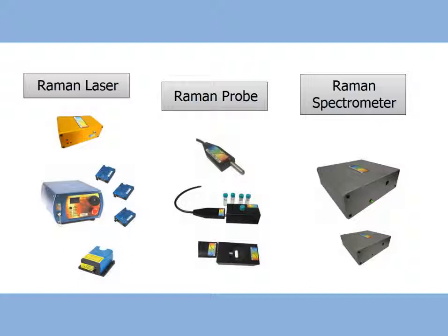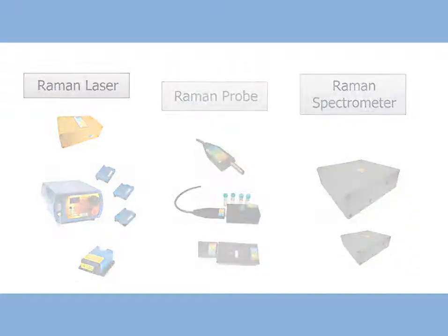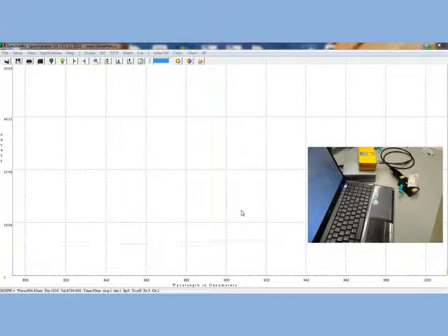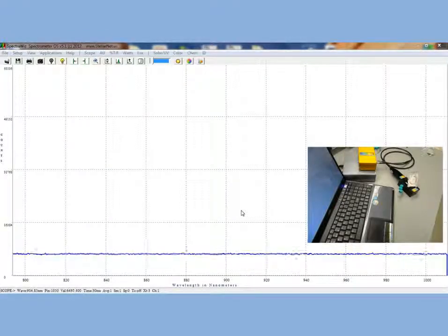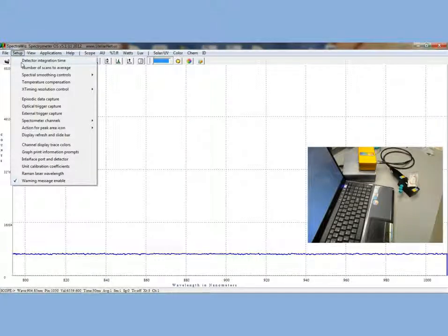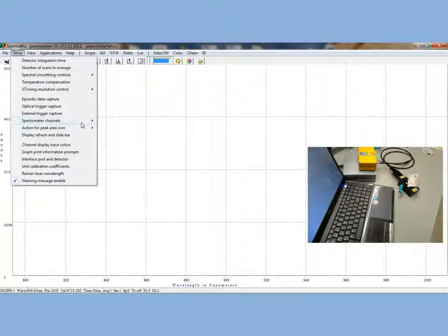This Raman scattered light contains unique information about a molecule's vibration and other excitational modes and produces a finger-like spectrum which can be used for quick and simple non-contact sample identification. In today's demonstrations, we will be using a StellarNet Raman HR TEC cooled spectrometer, a 785 nanometer Raman laser, and the Raman probe.